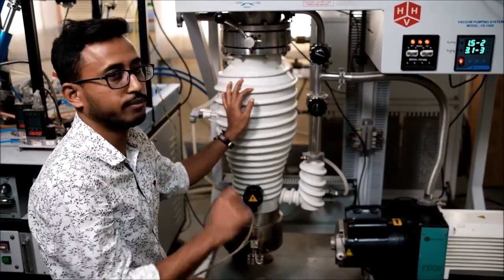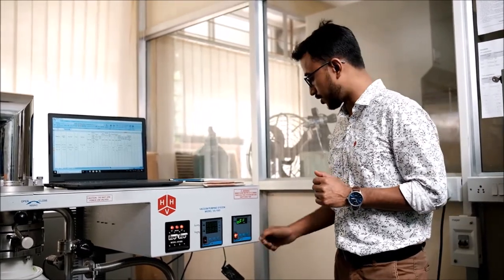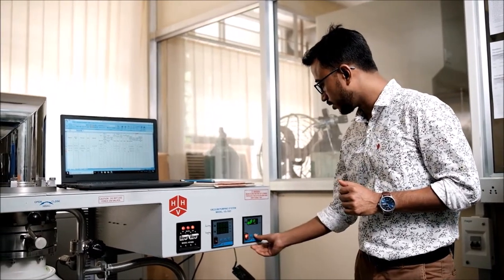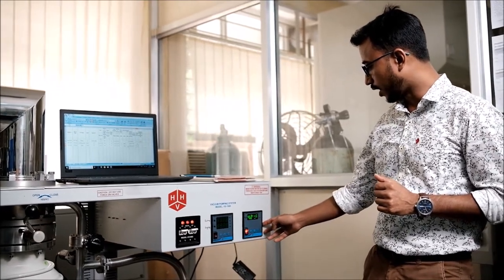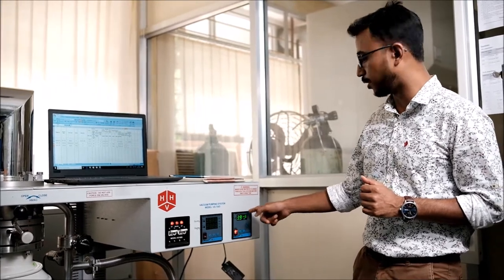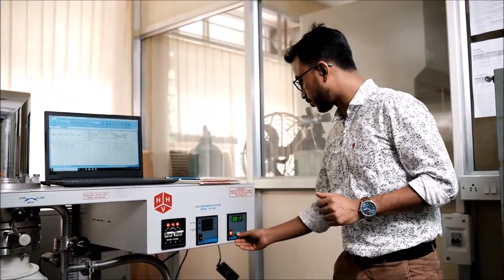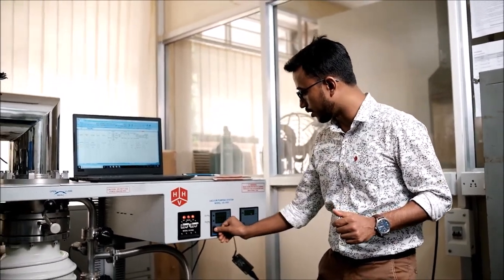The chamber is now connected to the diffusion pump and at the back of the diffusion pump the rotary pump is connected. Inside the diffusion pump, the mechanical structure converts the vaporized oil into a jet; when the jet enters from the center to the wall, it transfers its momentum to air molecules, bringing them from the top down to the bottom where the rotary pump removes them, reducing the pressure to 10⁻⁶ mbar. Chilled water is passed along the chamber wall to condense the vaporized oil back to liquid, and the cycle repeats. It takes more than an hour to reach 10⁻⁶ mbar. After an hour, we check the pressure and see it is below 4.0 × 10⁻⁶ mbar, so we are ready to start deposition.